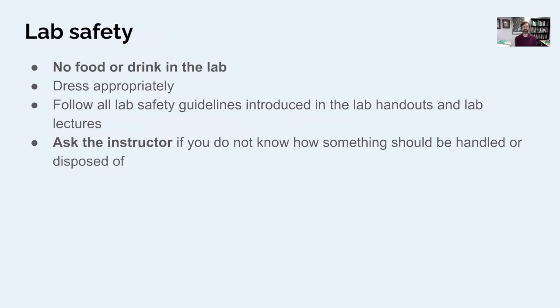Okay, so as far as lab safety, in general, if you're in the lab room, there is never any food or drink allowed. You can bring in closed containers, a closed container with a sandwich in there, a closed container with a beverage, but I don't want you to be eating or drinking while we're in the lab room.